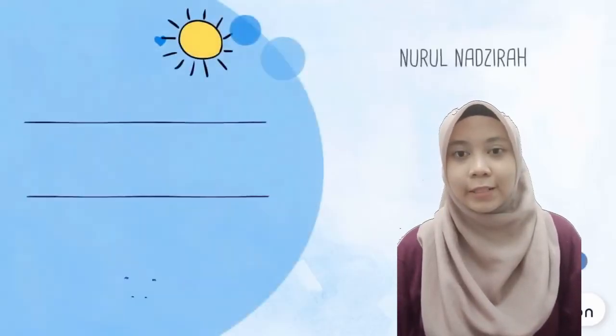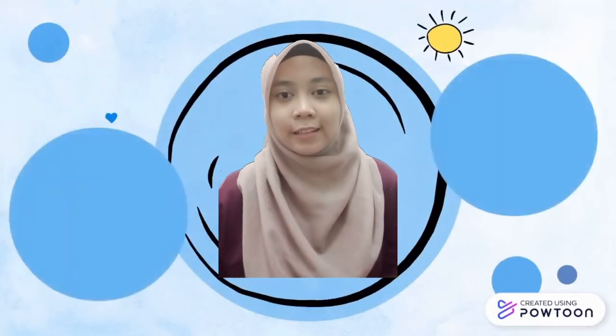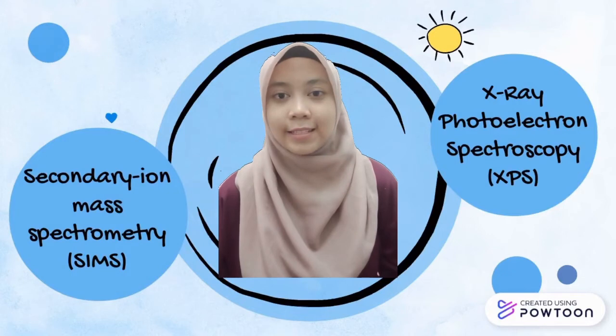First, I will explain about XPS and SIMS. There are two topics in this video, which are SIMS and XPS.